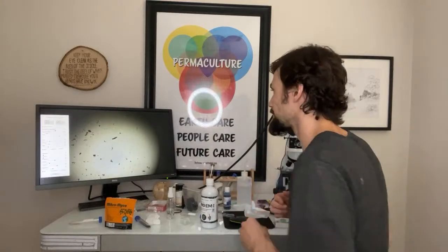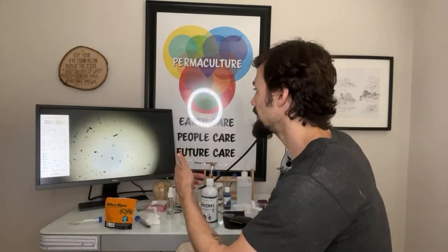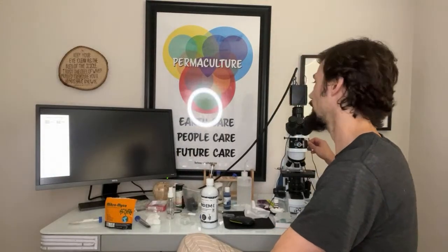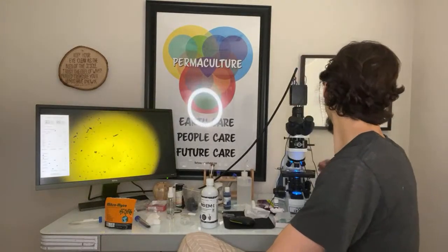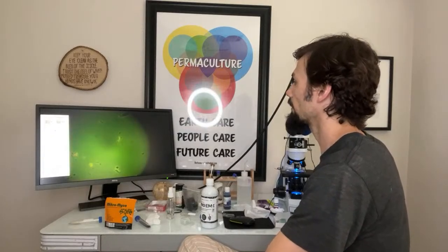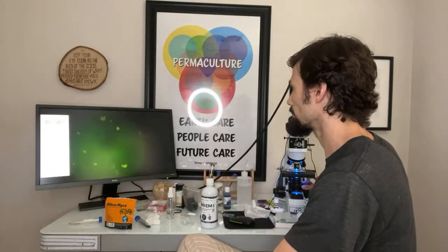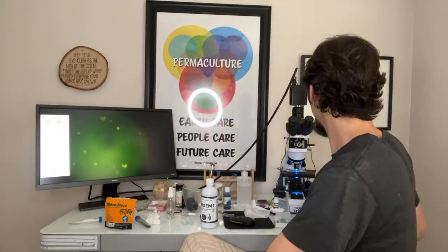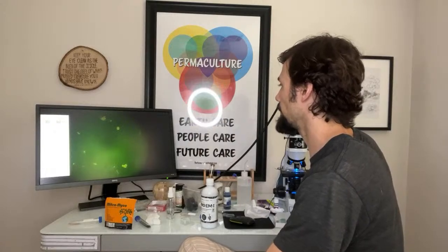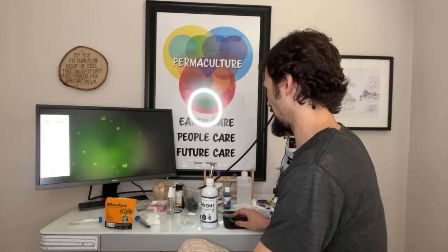All right, boom. Here we are in EM land. So immediately we see, I would say, yeast flakes. Let's turn down the light all the way. Let's just zoom in. Heck yeah. Look how bright those are already. Like, all of that is fungal. So like, EM is like lit up with fungi already, just off the, whoa, hold on. That is a fantastic picture.